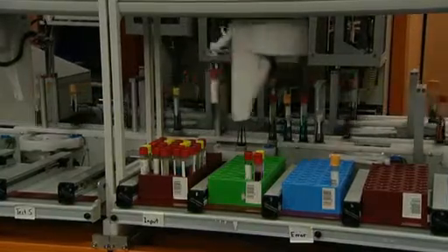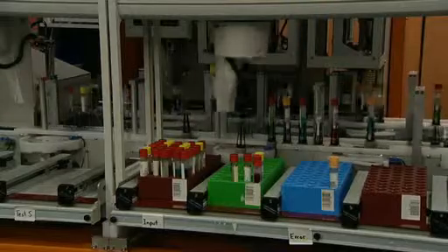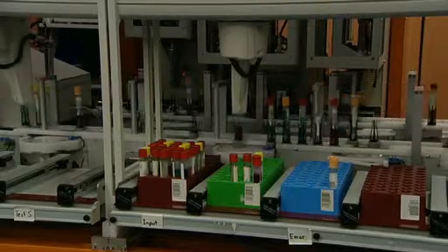In the late 70s, early 80s, one of our customers, who is also based in Brisbane, had an instrument called an inductively coupled plasma, and these instruments were quite expensive, and they wanted a way of automating the feeding of samples through this instrument over the weekend.